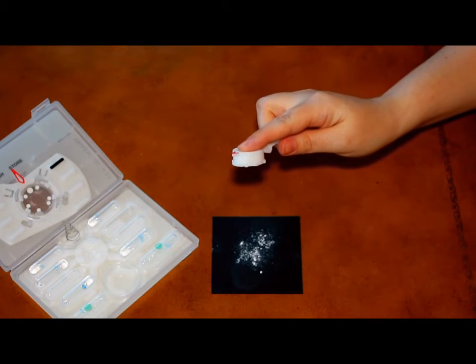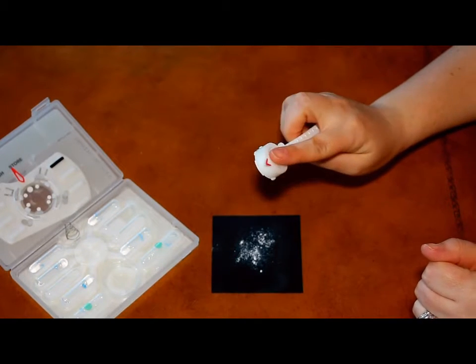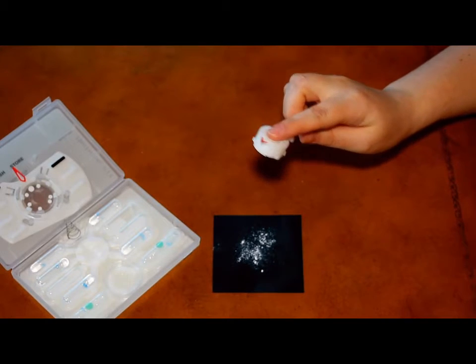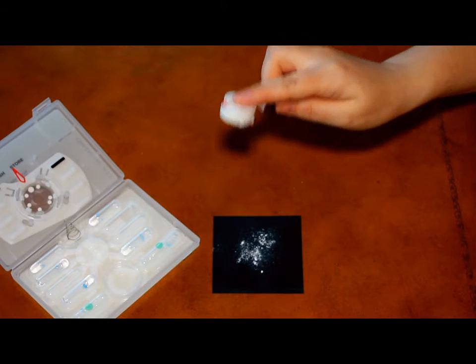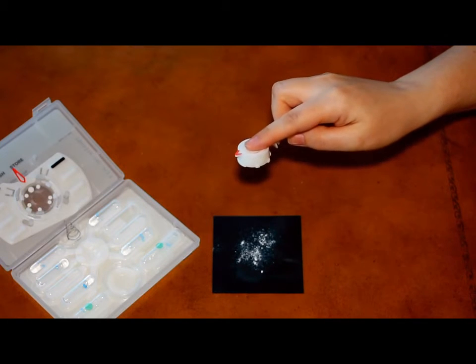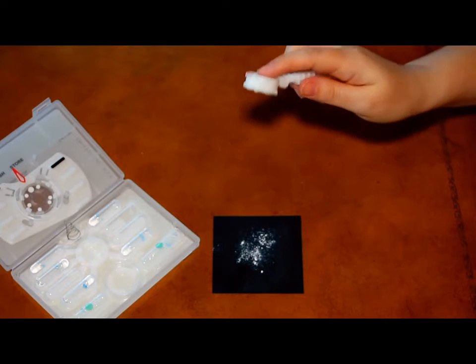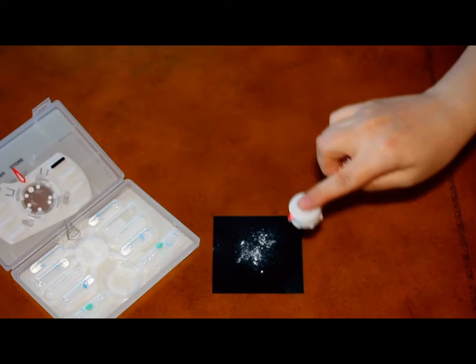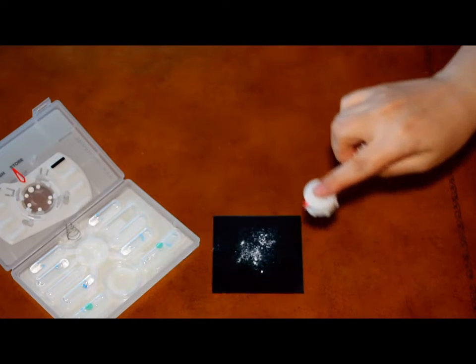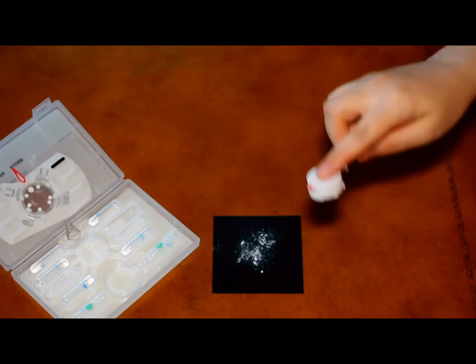There are three methods to collect your sample. The method you choose depends on the surface type and levels of sample. If you have a rough surface, dab the surface multiple times with your sample collector. If there is a bulk powder amount, dab the powder two to three times. Finally, if there is a trace powder amount, swab the surface thoroughly for 10 to 20 seconds in a figure-eight pattern. Since we have a bulk powder amount here, we'll use the dabbing method.